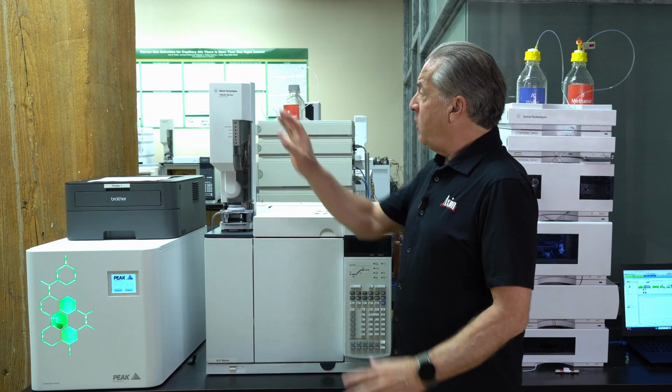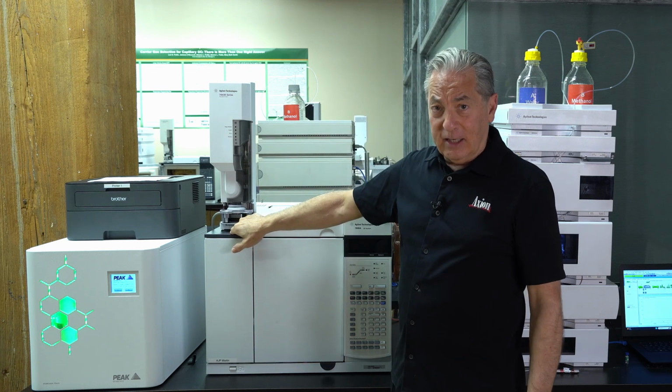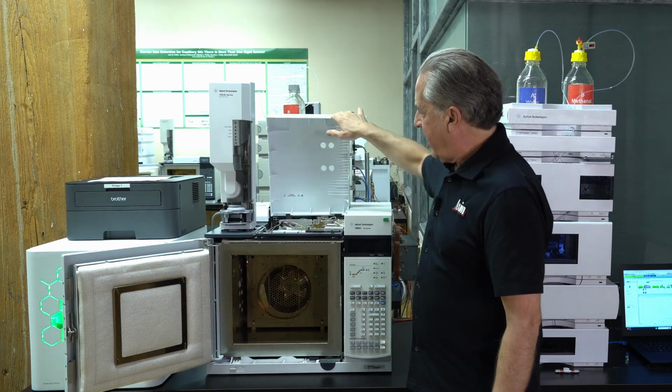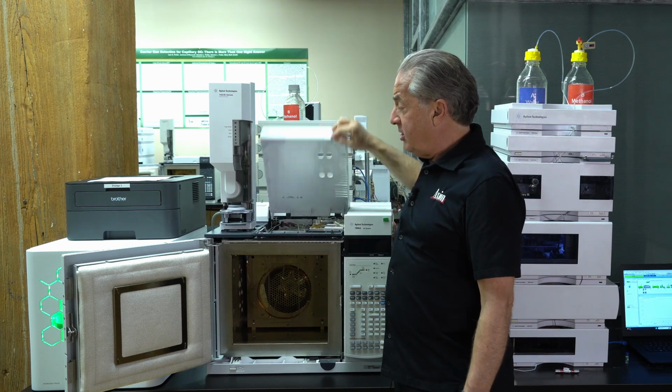We start off with the injector, it's the auto sampler, and then the next part is the inlet, and then we have the column. So if I pop this open, we can see a column, and then I have the detector, and then ultimately the data system. So those are the components of the GC.